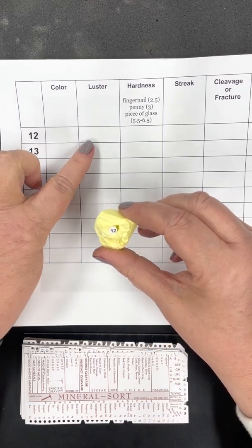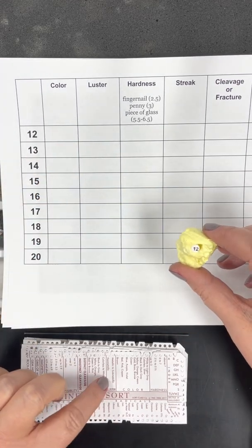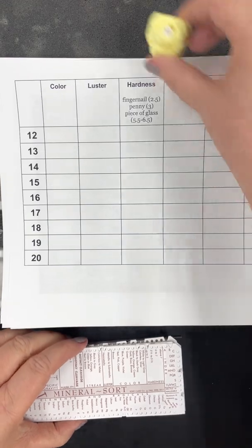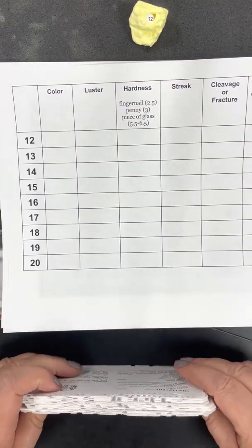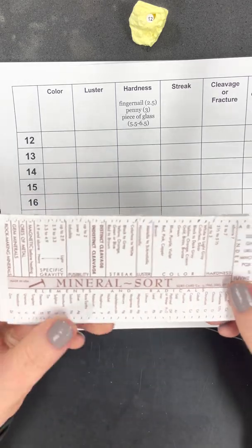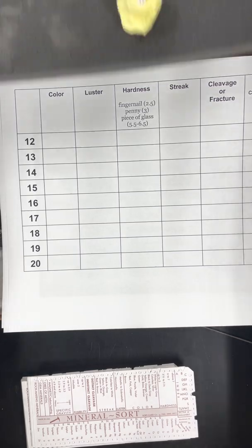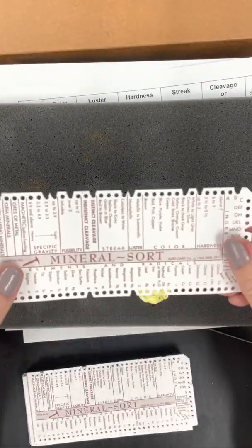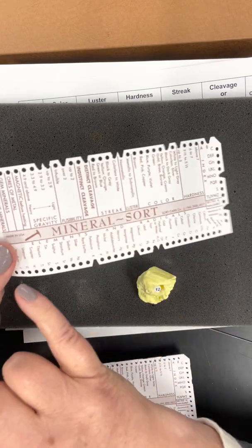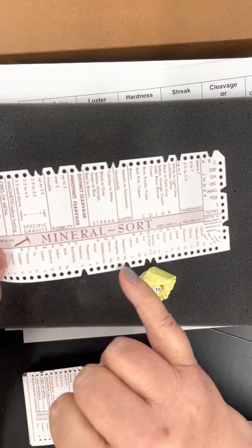The next thing we want is luster. Before we do that though, I need to show you how to use these cards. So I've got all of the cards. It doesn't matter what order they're in, but I want you to notice that the cards have, let me use this black background here. That might be easier to see. The cards have all of these little holes punched out, and then sometimes they have notches.